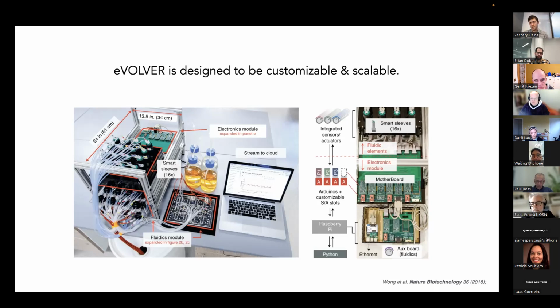to run two platforms simultaneously, I was making about 40 liters of media every couple days. And that's a couple grams of each antibiotic into each of those carboys, basically. So I think that's the main cost. I did run the numbers at one point. It can get kind of pricey with the antibiotics to run ePace at that scale. But if you do the numbers with the antibiotics, it's probably a few $1,000s for a week of running. The system itself doesn't cost anything really to run. It's just the electricity to keep it on, but it's not consuming massive amounts of power. So it's really just your media as the main cost driver there.